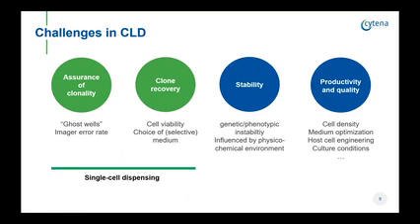And today I want to talk about 2 technologies that address some of these challenges associated with CLD workflows. Most importantly, the assurance of clonality and also clone recovery.